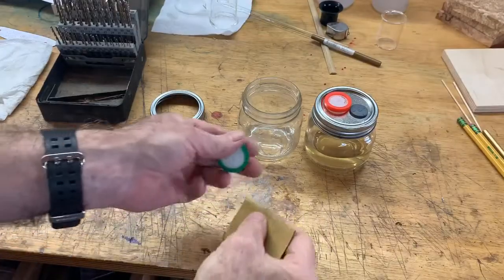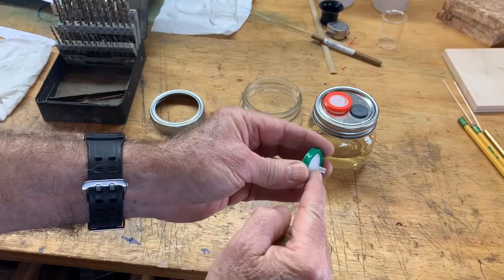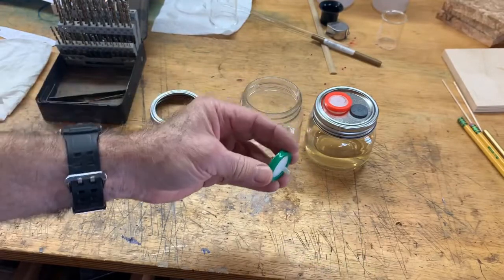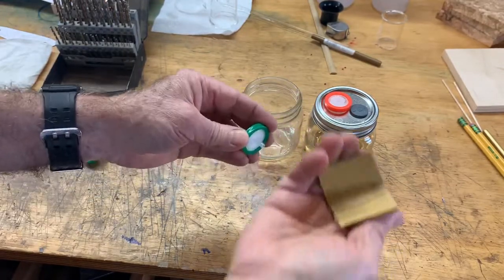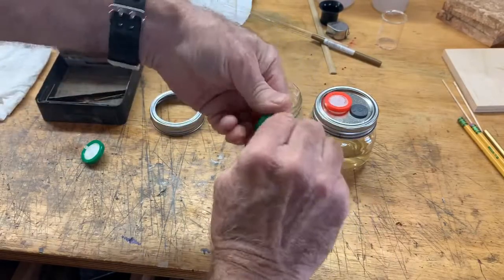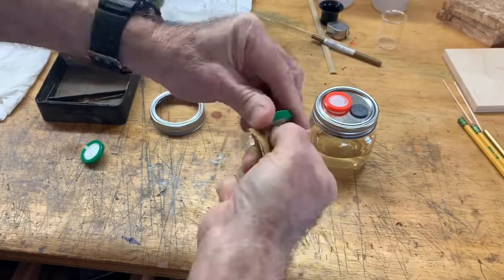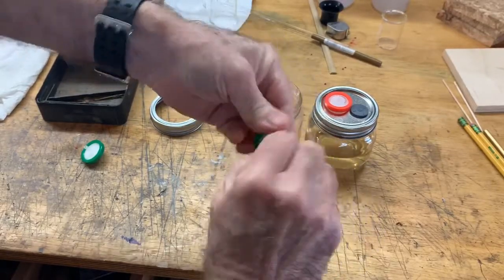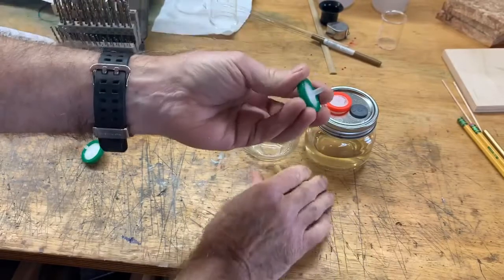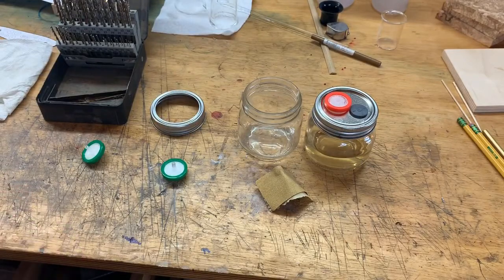A very important thing is to rough up the surface of this polyethylene, because the RTV won't stick to it unless you do that. So I've got 120-grit sandpaper and I'm just going around to take the shine off of that surface. Then the RTV sticks to it well enough to keep it in there, and these lids will last for years.